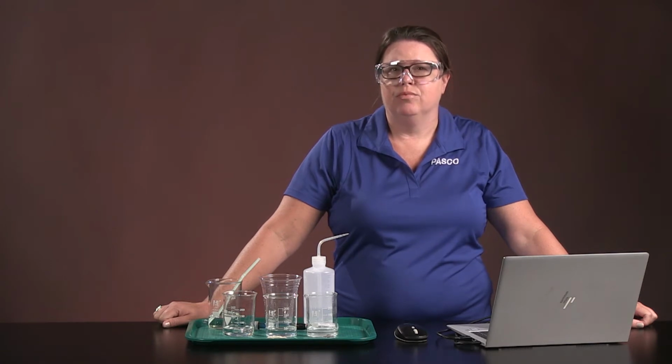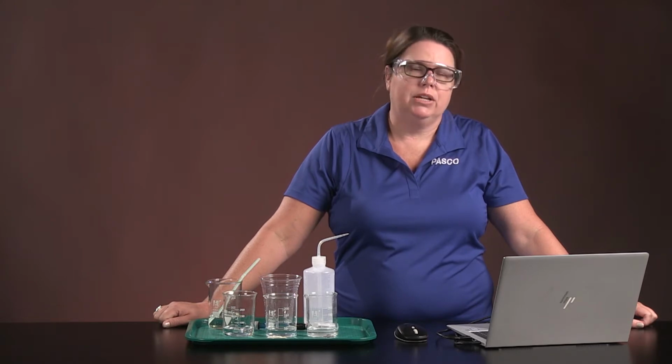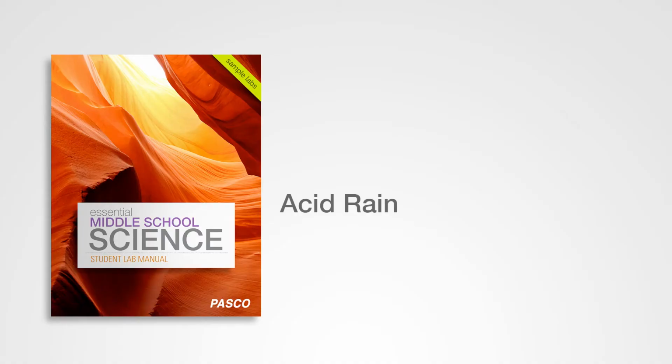What effect can acid rain have on architectural materials? Let's investigate using a few common construction materials. This is acid rain.